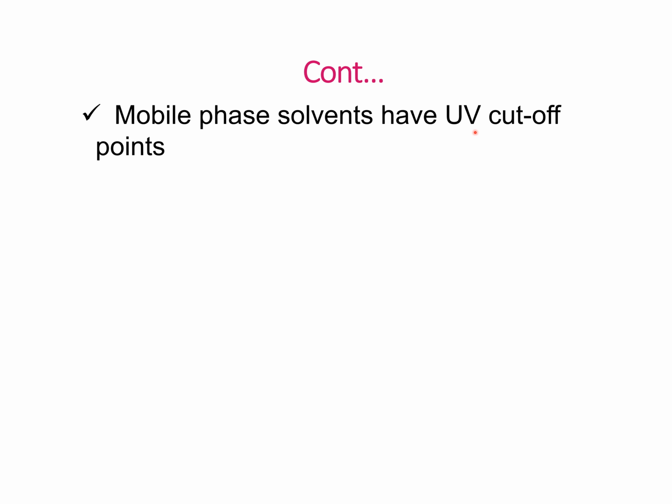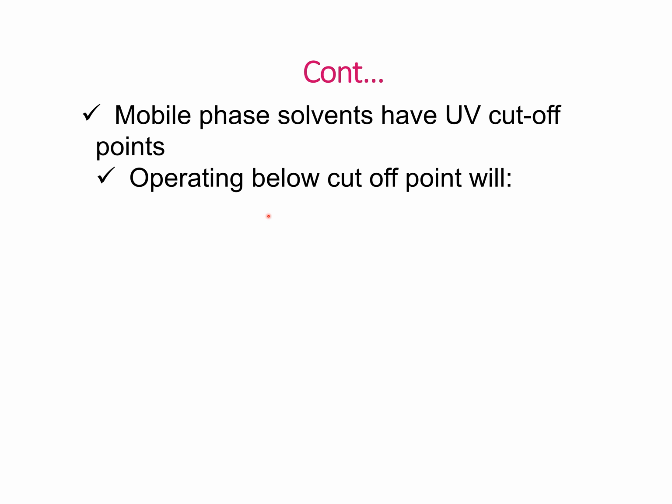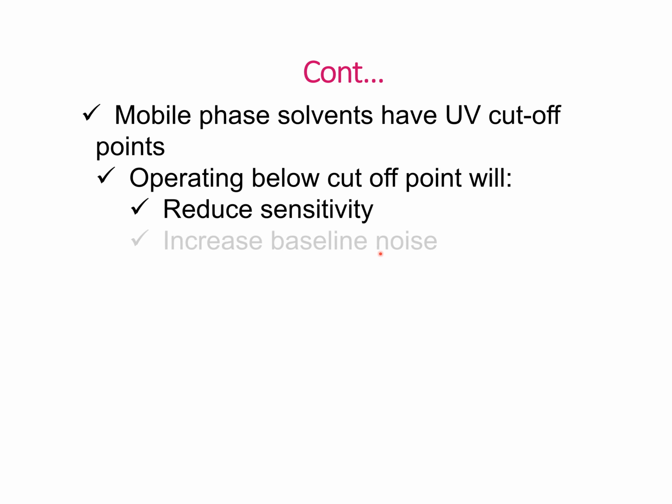Mobile phase solvents have UV cutoff points. Operating below cutoff point will reduce sensitivity and increase baseline noise.